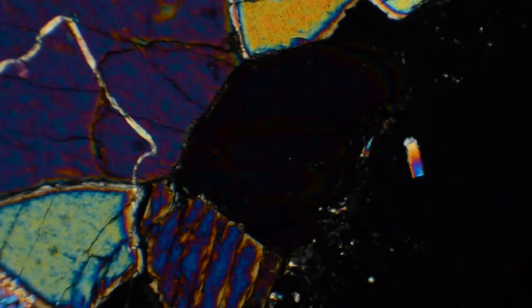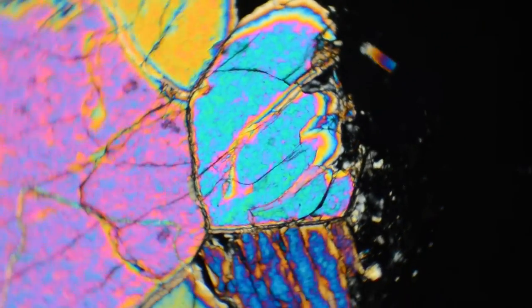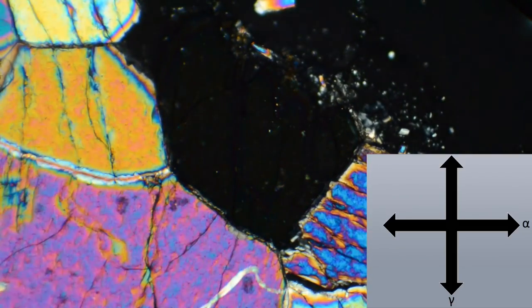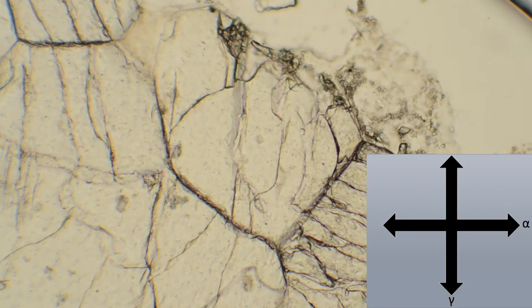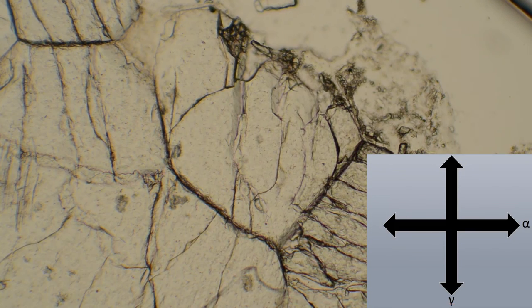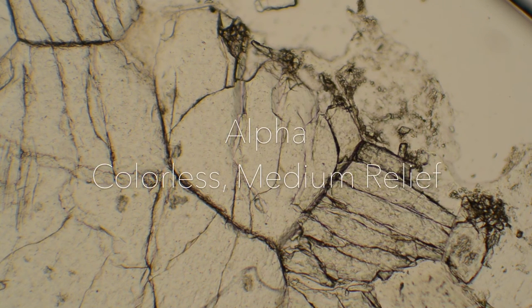Next, I put my cross polarizer in and rotate another 90 degrees counterclockwise to the next extinction position. This aligns alpha with the lower polarizer. Again, without moving the stage, I can observe color and relief in plain polarized light. Along alpha, our grain is colorless with medium relief.